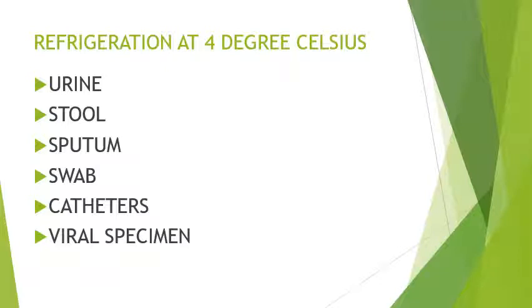Okay, refrigerator at 4 degrees Celsius. Note if it is not within the 2-hour period. If you have already consumed the 2 hours, you need to put it immediately in the ref at 4 degrees Celsius. Our ref is roughly 2 degrees Celsius to 8 degrees Celsius.